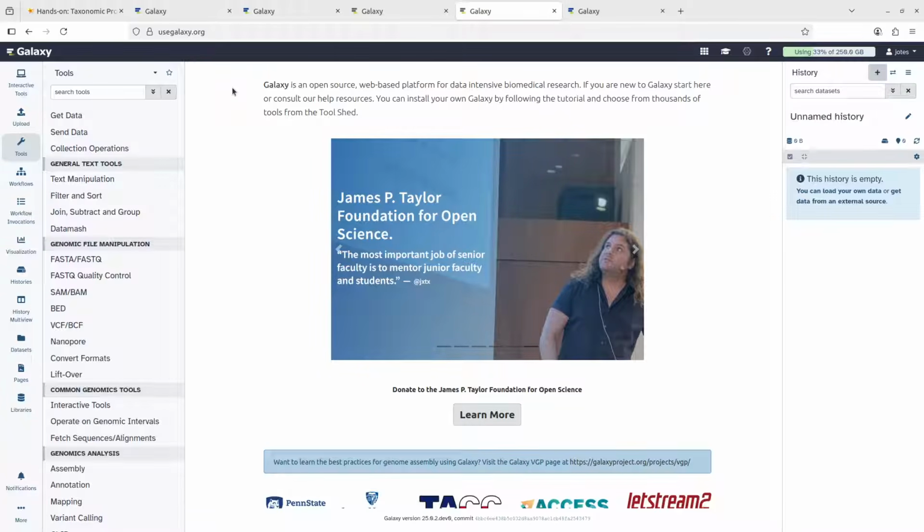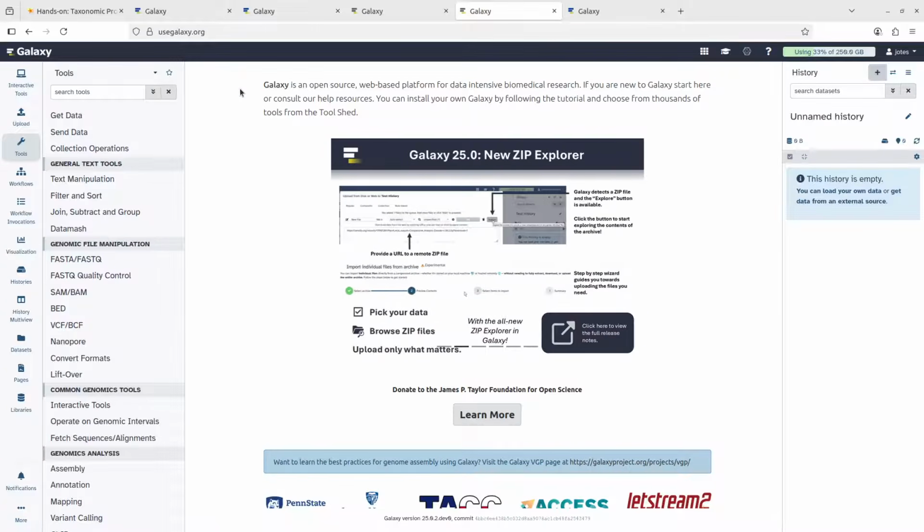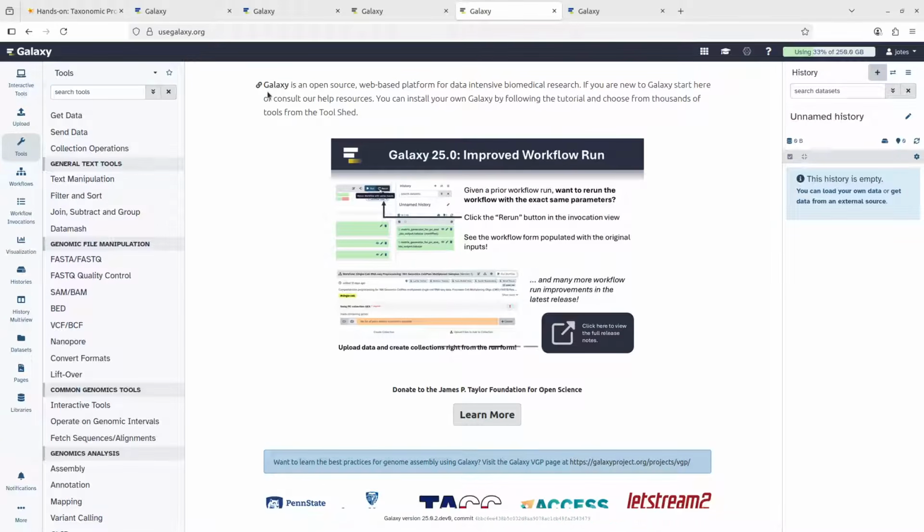If you are going to classify your reads, obviously you will need to have your input files. Because we are dealing with NGS data, you need to have your data. I have an example data set that we are going to use. So for beginners, no need to look for data. I will show you how to get it.